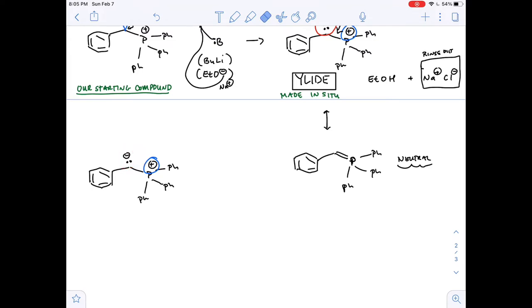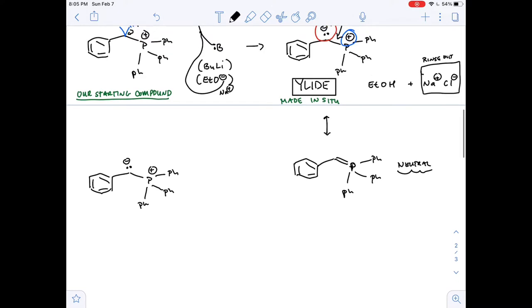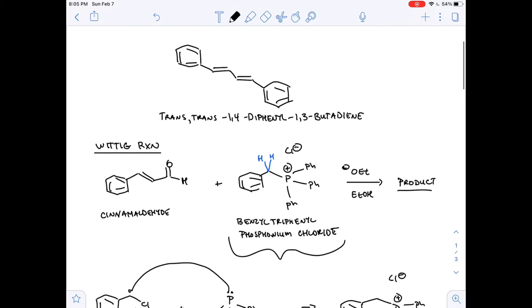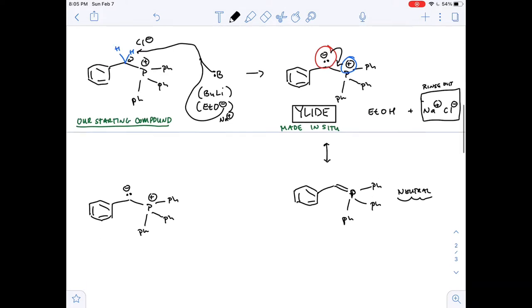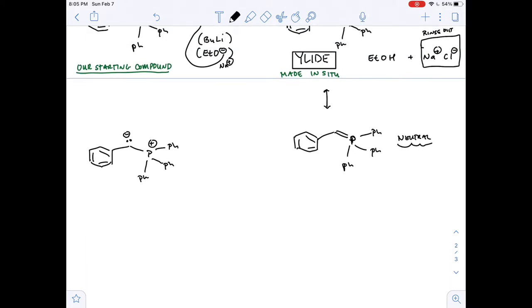So again, I like to just show the ylide like this so that it's very obvious what the nucleophilic site is, right? Because that nucleophilic site does the attacking on the electrophilic site, and it does it on the cinnamaldehyde. So that cinnamaldehyde right here, I'm going to go ahead and abbreviate it. I just want to throw in a carbonyl compound to react with this ylide, okay? And so I'll draw the rest of that cinnamaldehyde with an R group, because I'm not about to draw all that.